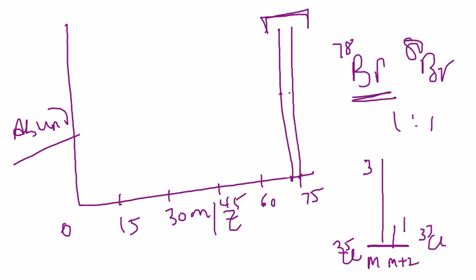So again, to reiterate, when you run a mass spec, the molecular ion is the maximum that you usually see on the x-axis, and the highest that you see on the y-axis, which is the abundance, is your base peak. Looking at the pattern, one can talk about the isotopes.